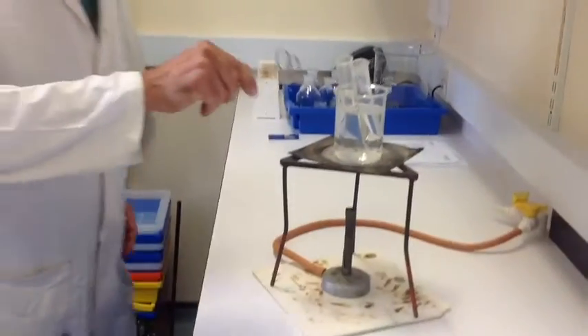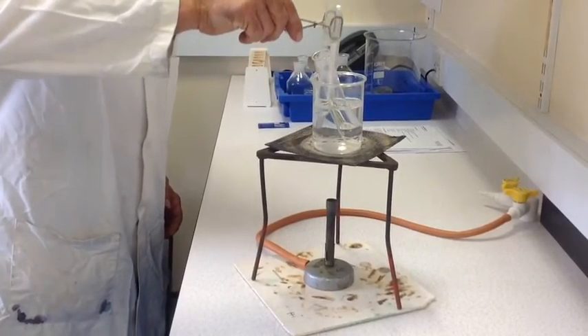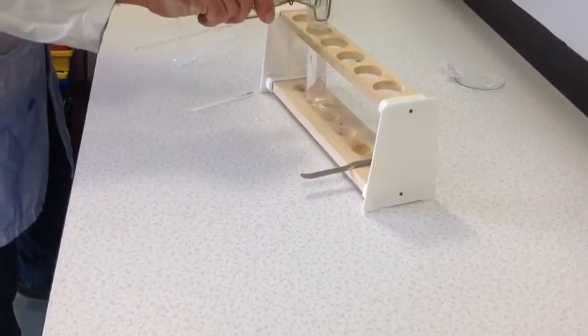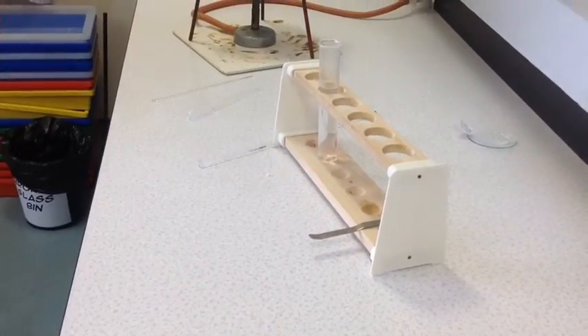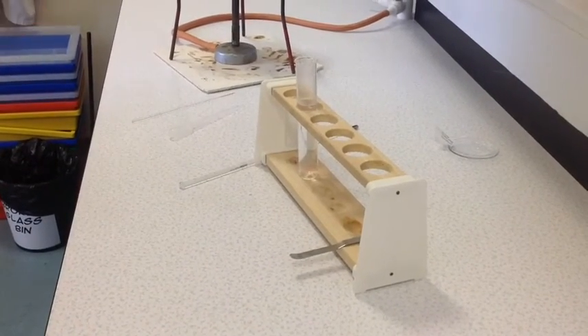My Benzoic Acid Crystals have now dissolved in the hot deionized water. I am now going to remove the tube from the hot water bath carefully and place it into the rack. We are going to leave that to cool slowly until crystals start forming.